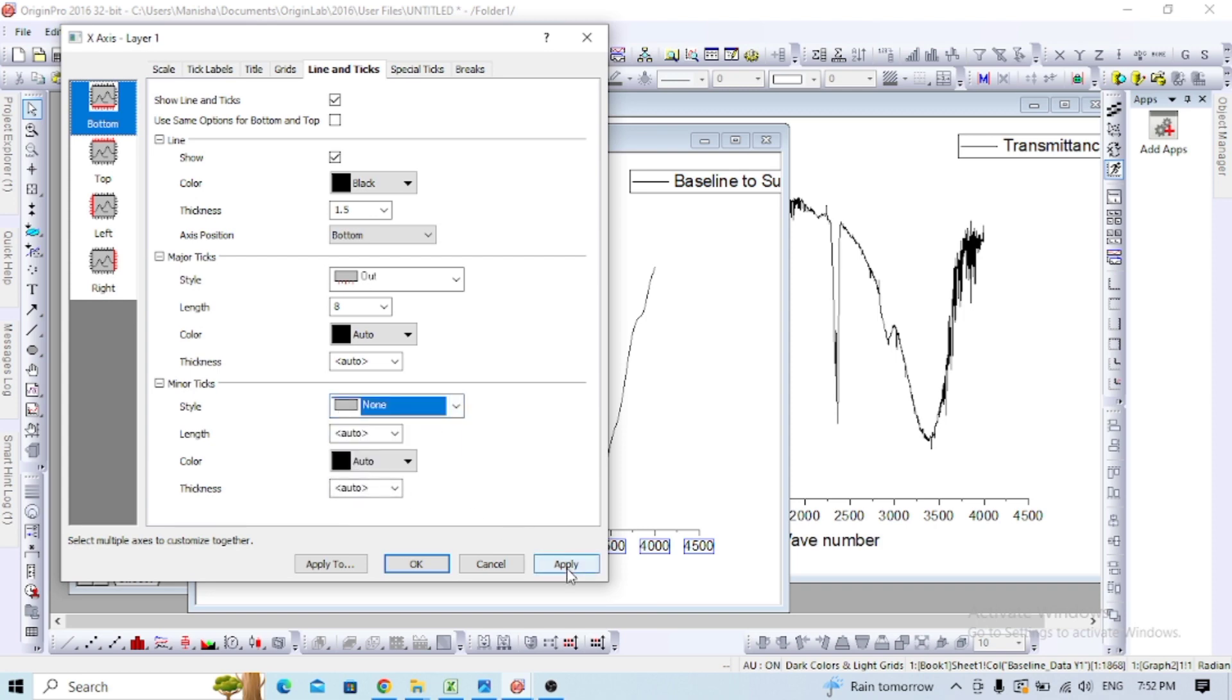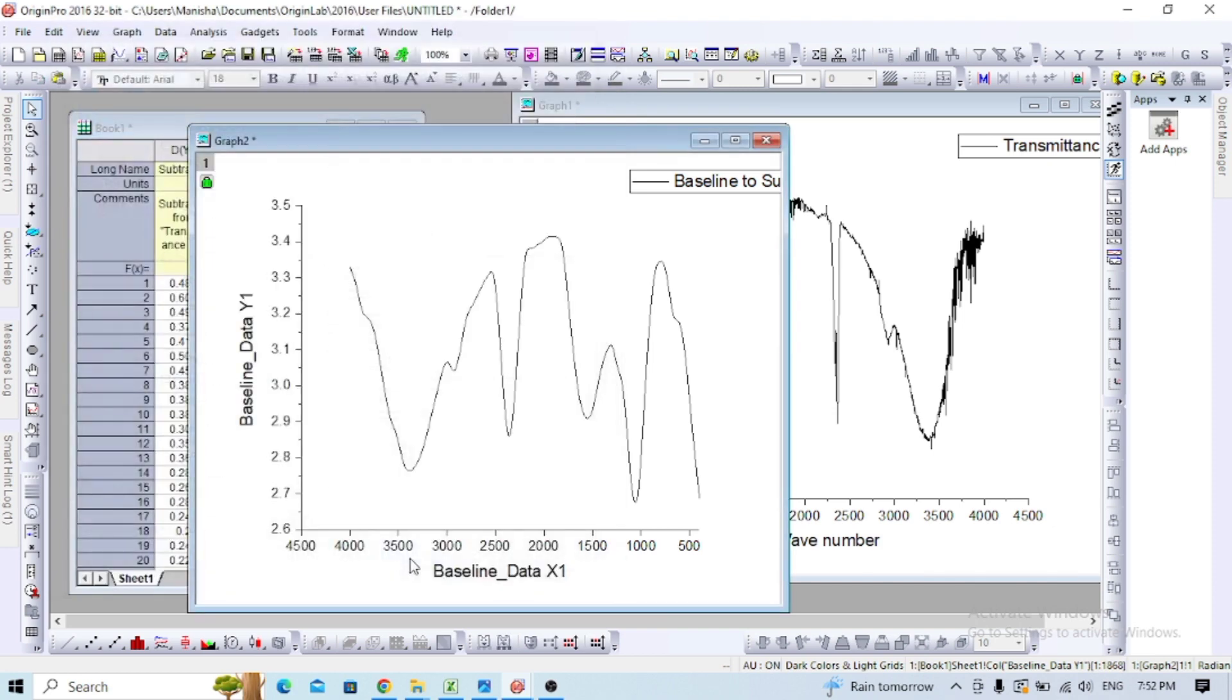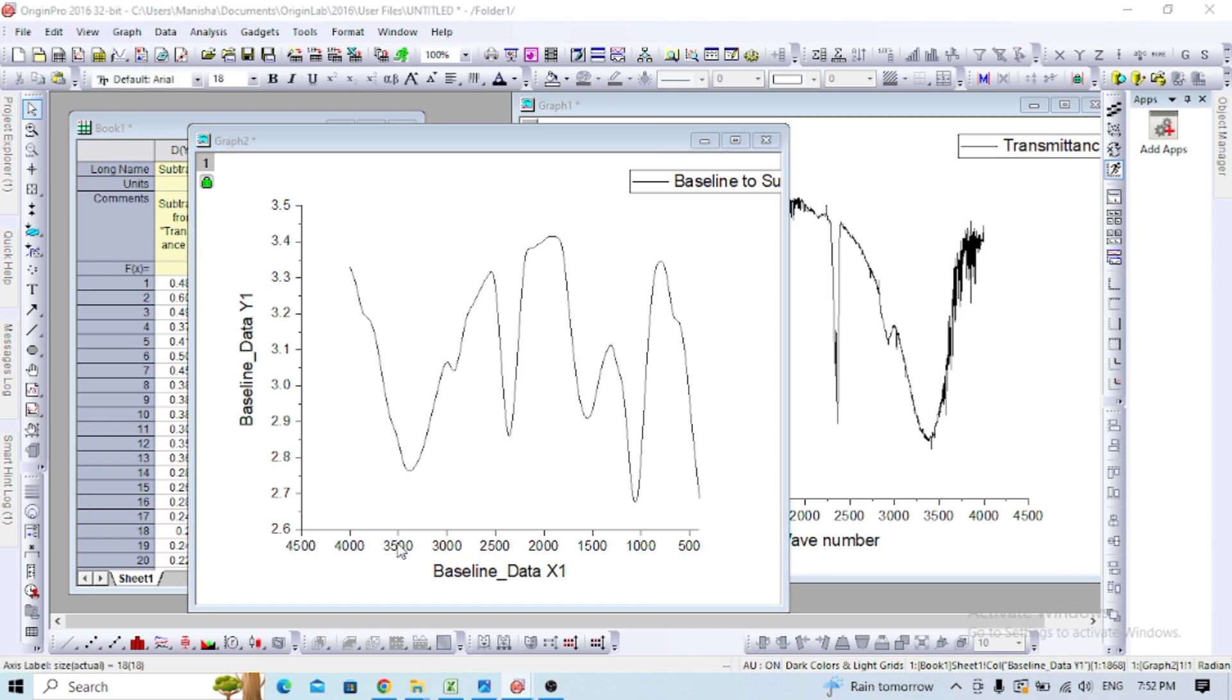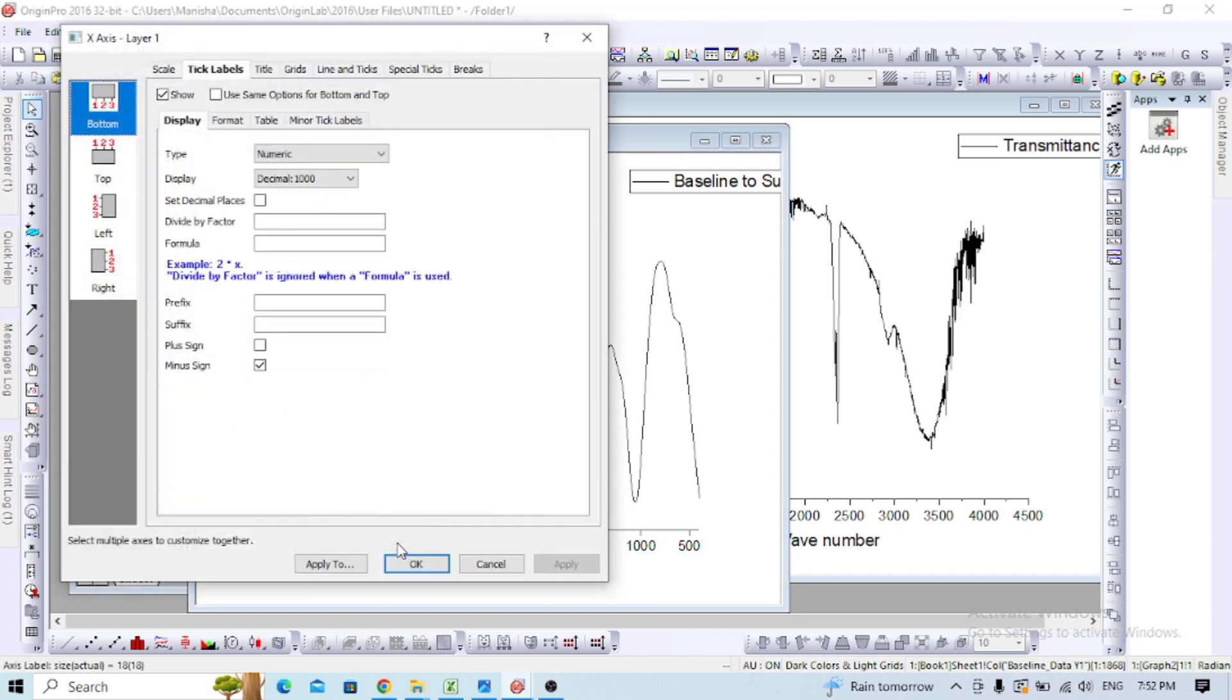There's still some adjustment needed, so you can change the data scale again.